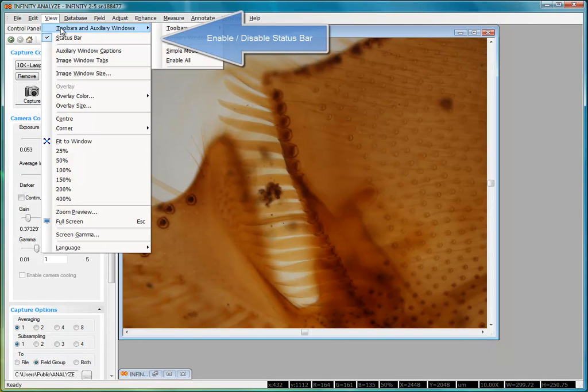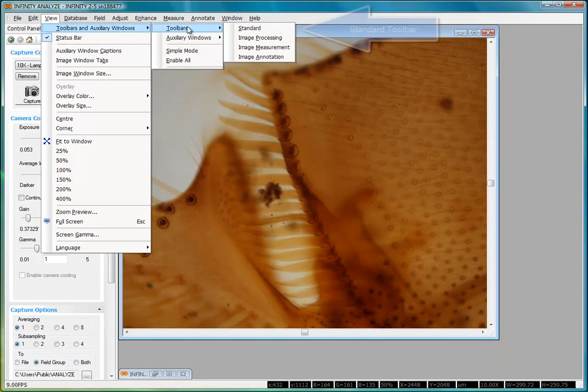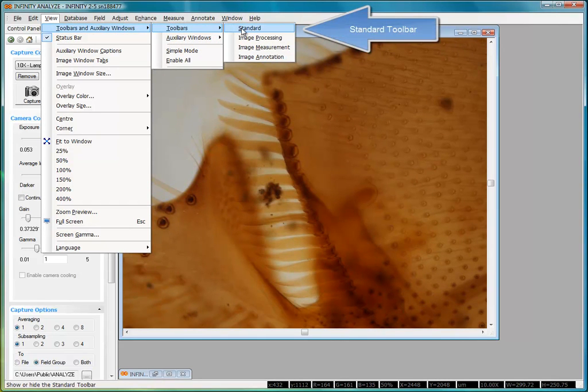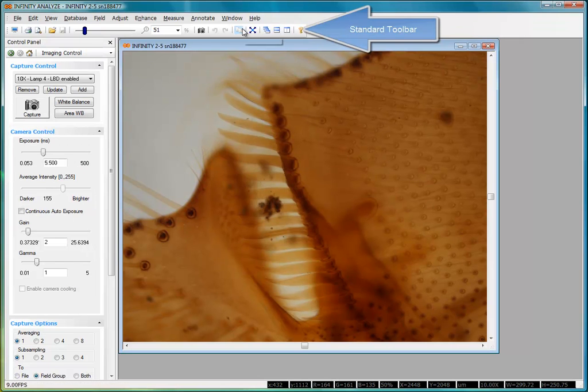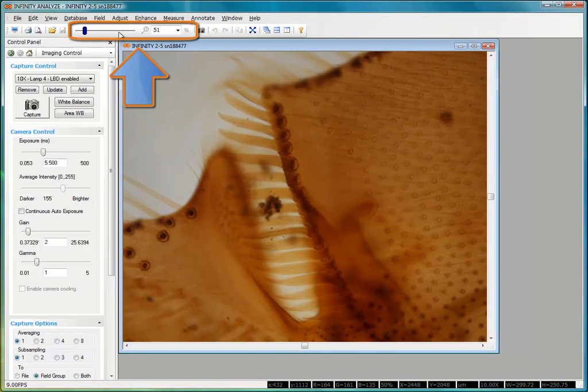Toolbars and auxiliary windows can be used to get to the toolbars and turn on the standard toolbar, and that's where we'll locate the zoom control.